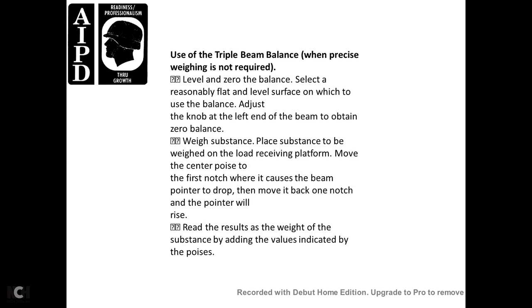Using the triple beam balance when precise weighing is not required: level the balance. Select a reasonably flat and level surface on which to use the balance. Adjust the knob at the left end of the beam to obtain the zero balance.